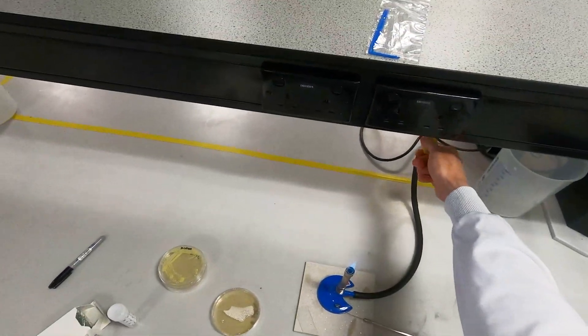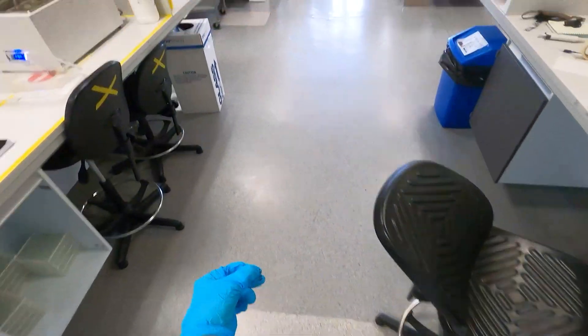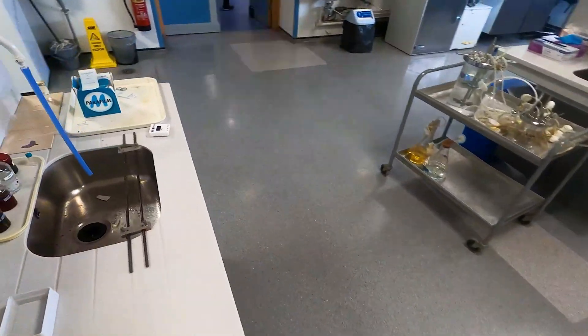Now you need to turn your Bunsen off, go get some gloves on and put your safety goggles on. Now you need to make your way over to the sink to start your Gram stain.